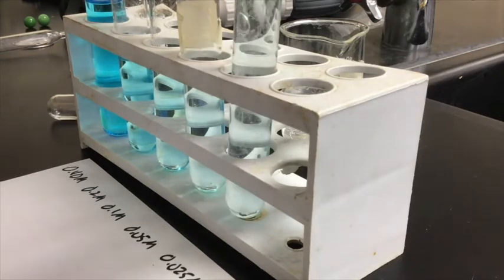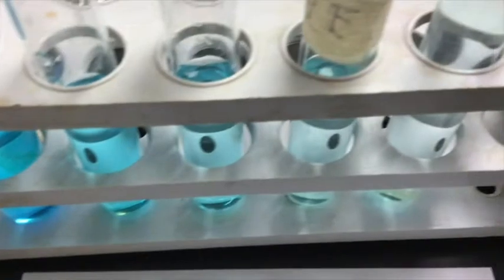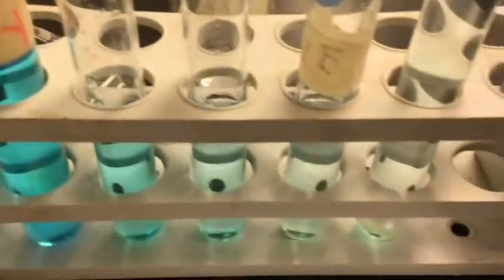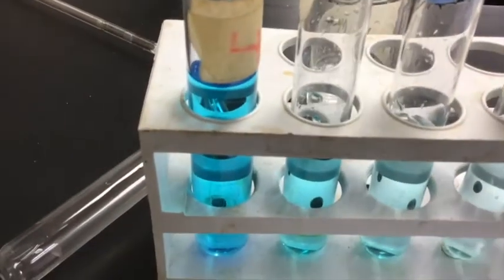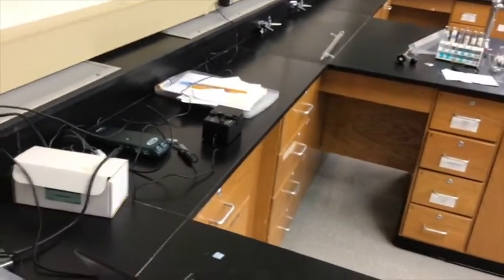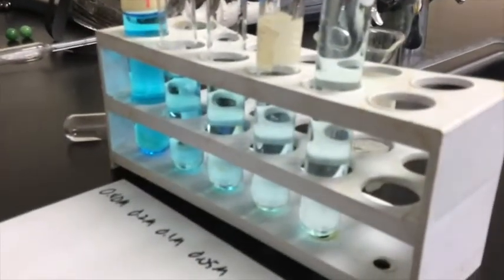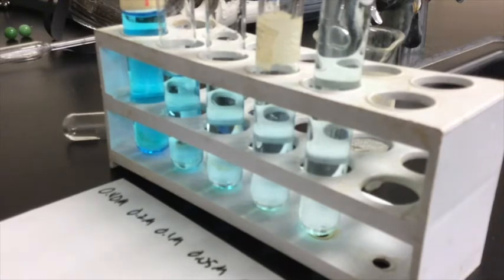And back in the day, before computers, they would just kind of eyeball it. They would take an unknown solution and eyeball it and say, well, is it between this and this, or is it between this and this? But we don't have to eyeball it. We have computers, and we have a colorimeter device there. And because we have computers and a colorimeter device, and we know about Beer's Law, we can set up a known plot of all of these 5 and then compare that known plot to our unknown and see where our unknown fits in amongst all of these.